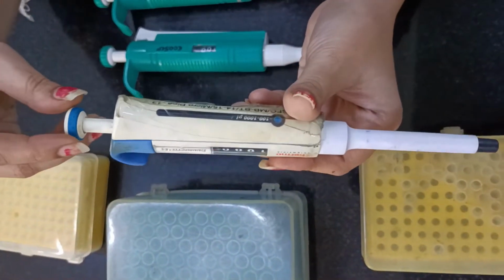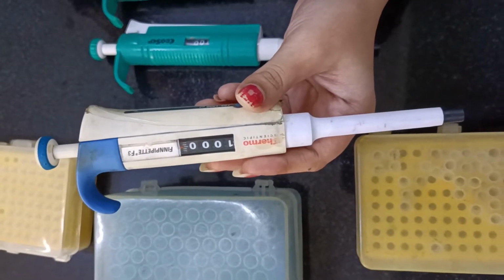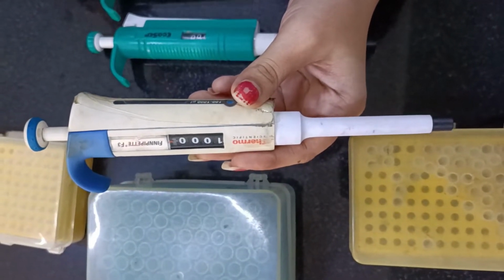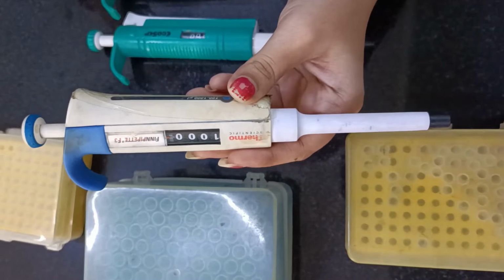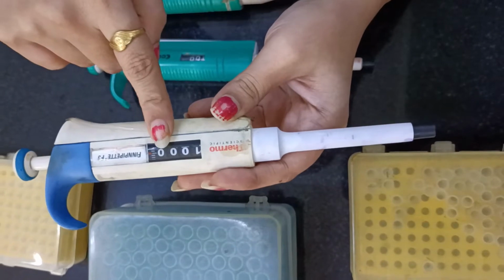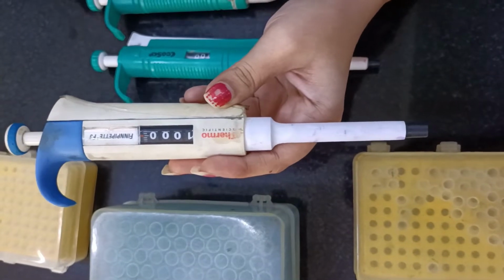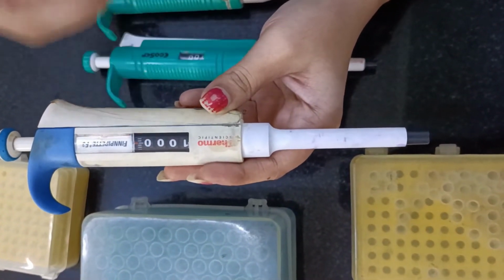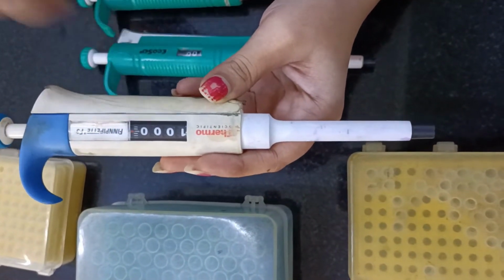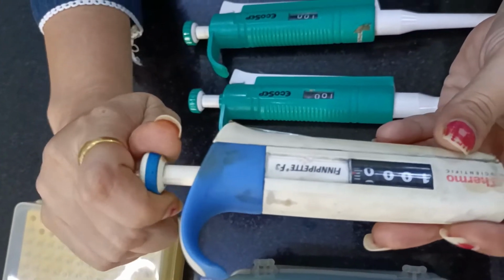Before going ahead, we'll understand how a specific volume is selected. For example, if you want to withdraw 500 microliter or 800 microliter, you have to specifically set the micropipette at 800 microliter, whichever desired volume you want to take out. So if I want to withdraw 800 microliter, I'm going to set this micropipette at 800 microliter with the help of this knob. Can you see this knob? You just have to turn this knob.